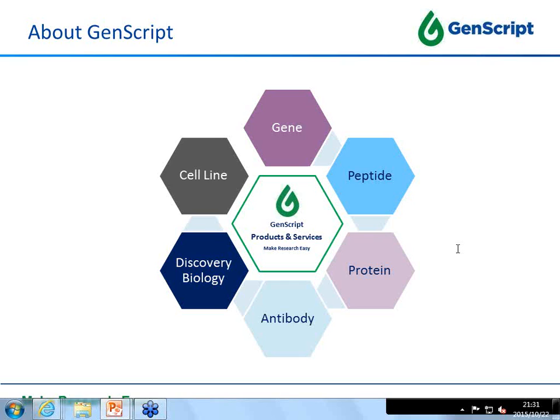So this is one reason for the instability, and the other reason is the non-transfected cells. They normally grow faster than the transfected cells because they don't need resources for expressing antibodies, so they just grow, and then the stable pool could get lower purity. This is another reason for the instability. So I would say these two reasons, but no worry for the stable cell line. I see. Great. Thanks, Hanshing.